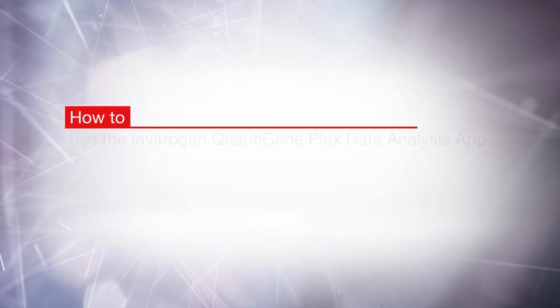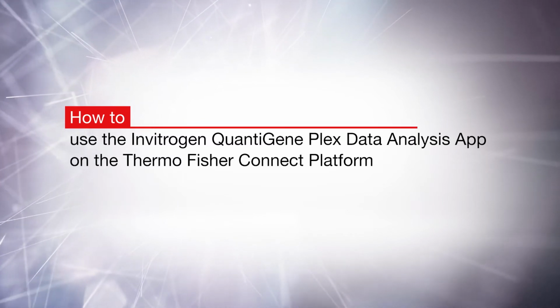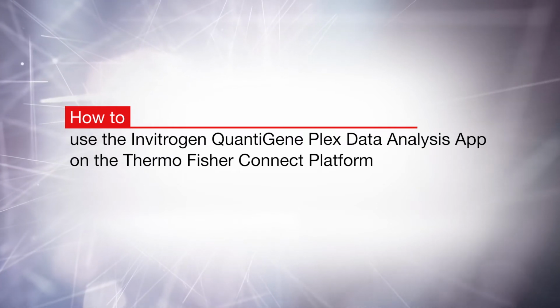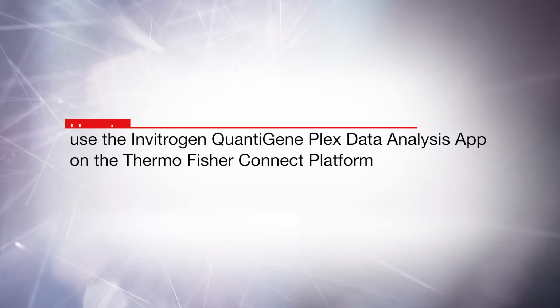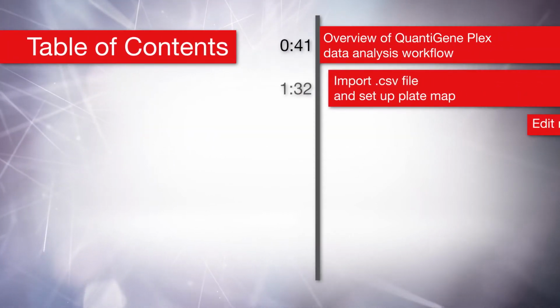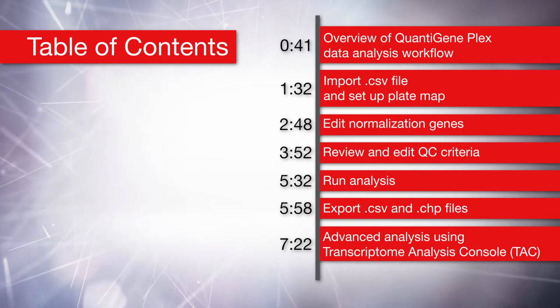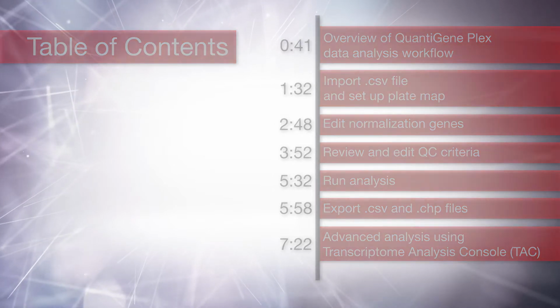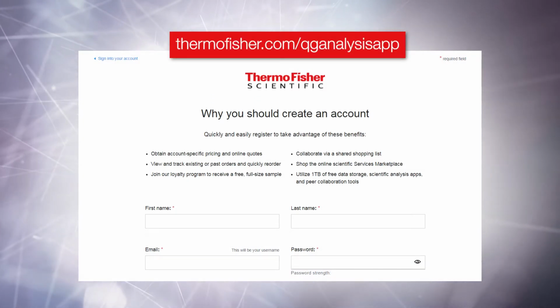In this video, we will demonstrate how to analyze data from the Invitrogen QuantiGene Plex assay using the QuantiGene Plex Data Analysis App. This cloud-based software app is offered free of charge to all QuantiGene customers. All you have to do is sign up for an account at thermofisher.com and use the link shown.